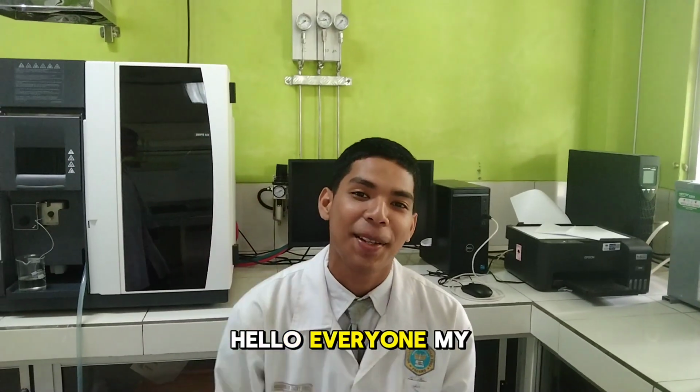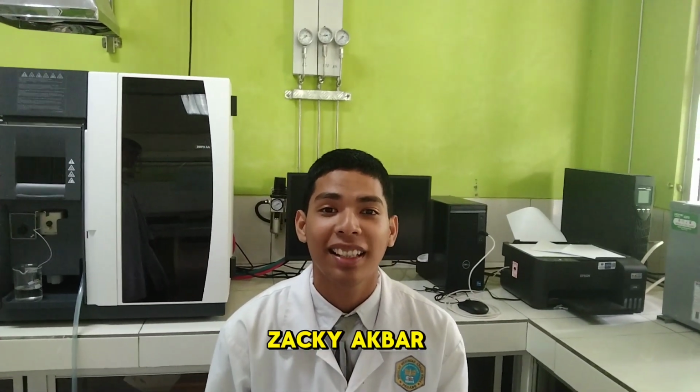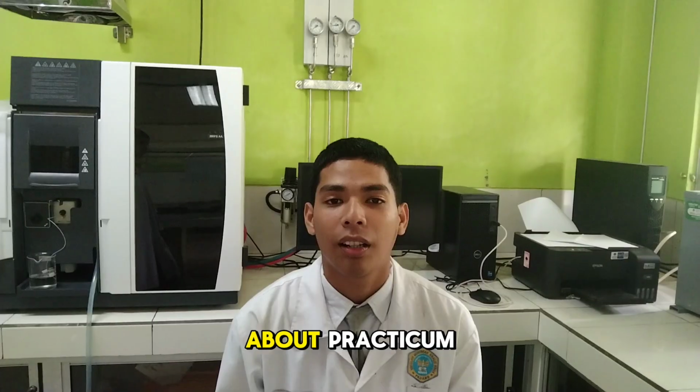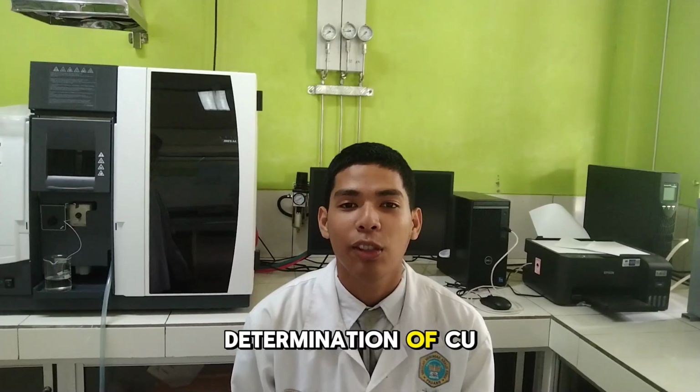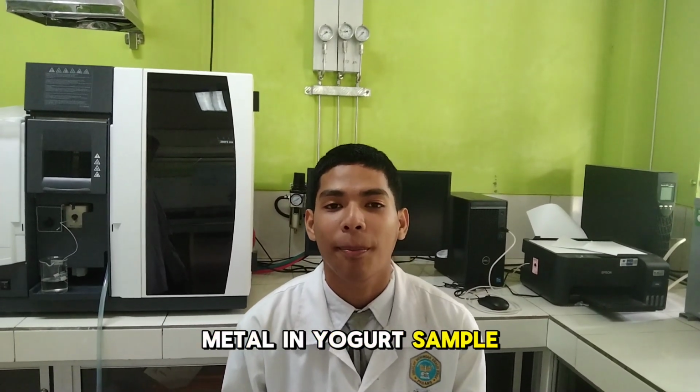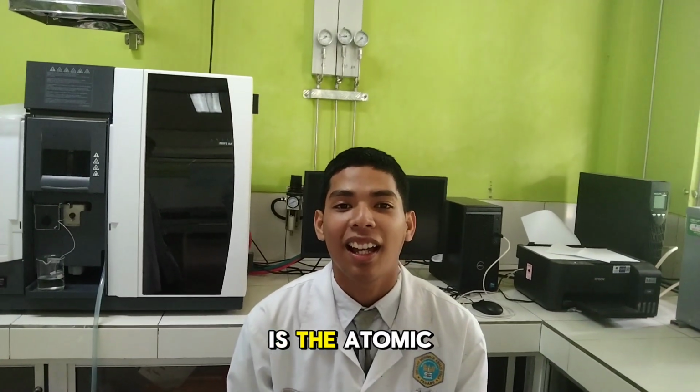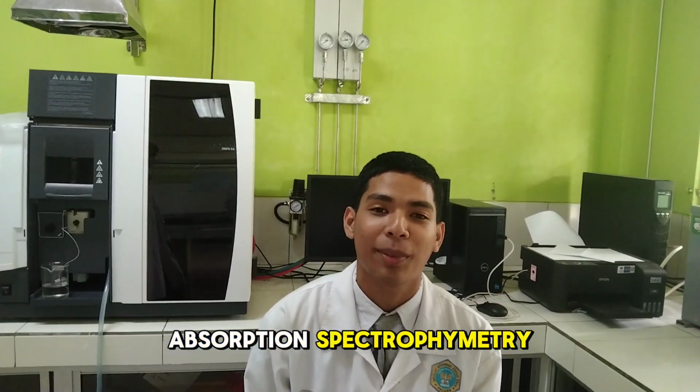Hello everyone, my name is Akbar, and in this video I want to explain to you about the practicum determination of Cu metal in yogurt sample with this tool, the atomic absorption spectrophotometry.